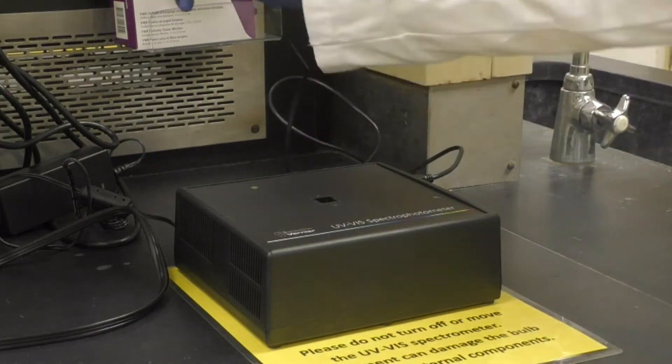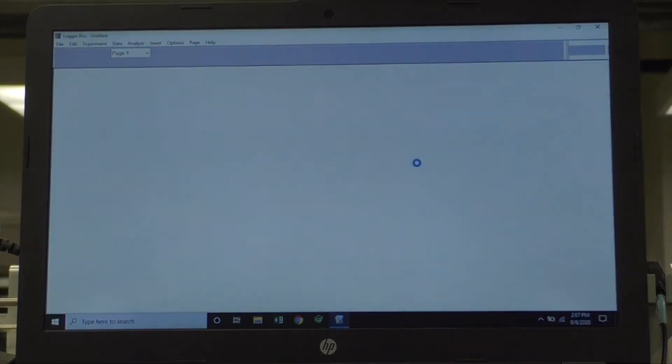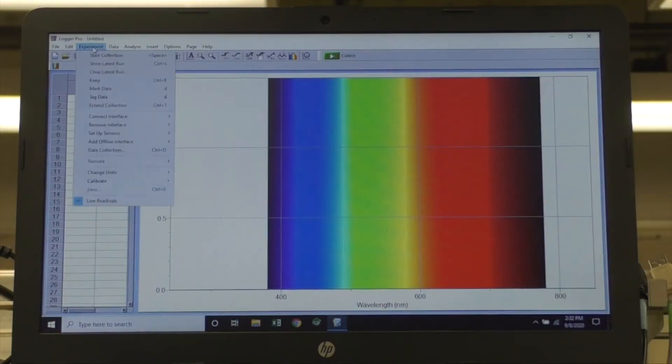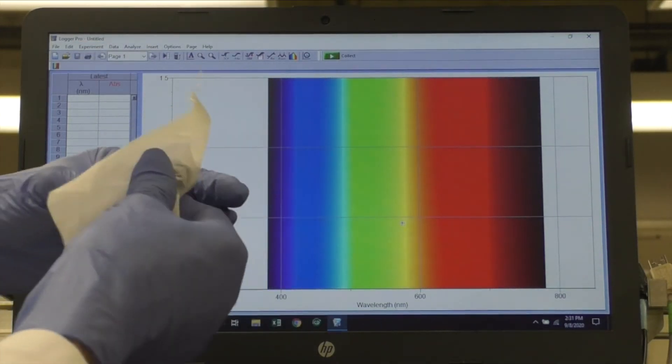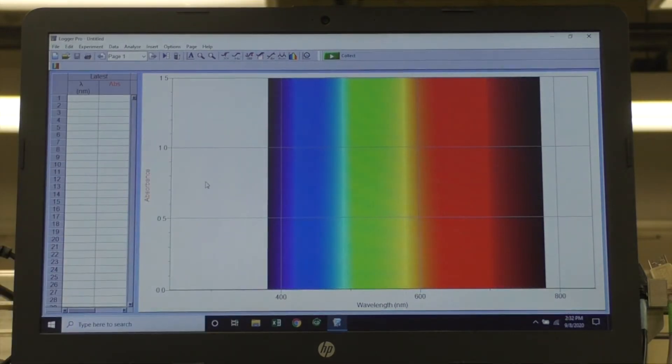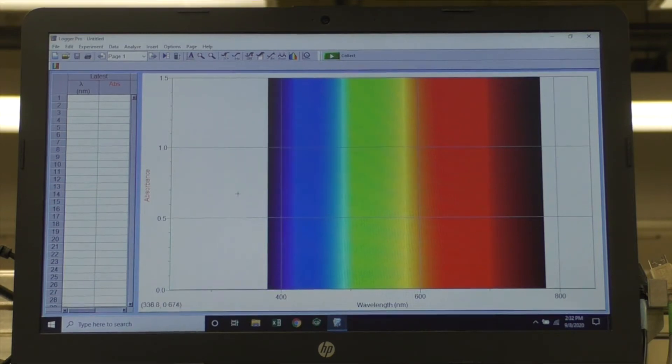Start by connecting the black USB cord from the UV-Viz spectrometer to your laptop and then opening up Logger Pro. Choose Experiment, Calibrate, Spectrometer 1. Using the prepared blank, wipe the cuvette and place it in the spectrometer with a clear side facing forward. Since the spectrometer is left on, click Skip Warm Up, Finish Calibration, and then OK or Done. Remember to put the blank back in your patient block.